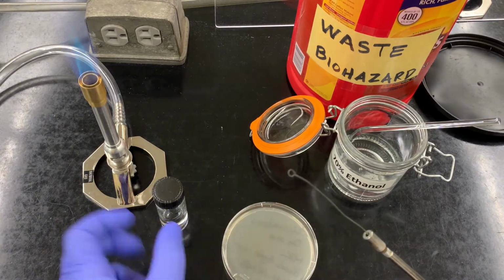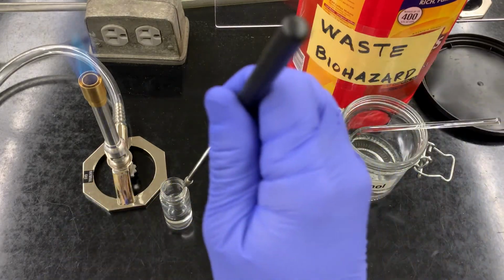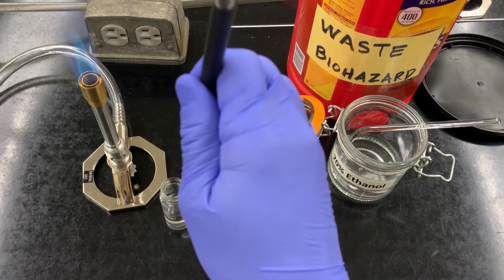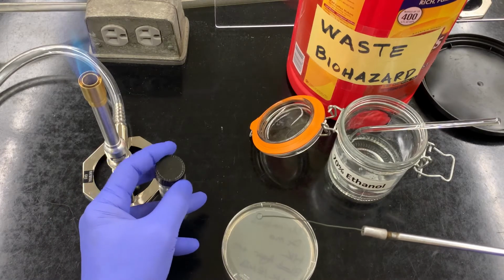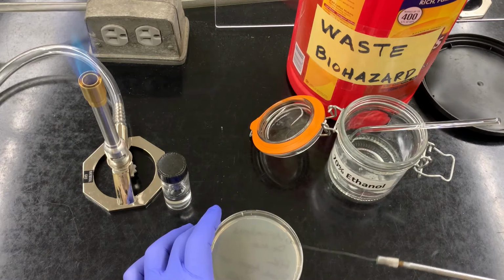All right, so the spreader method, this is the method that I prefer, is simply like this, right? You will just get your, oops, that was still hot. Just get your drop on your loop, and that's our simulated urine. For me today, it's water for demo purposes.